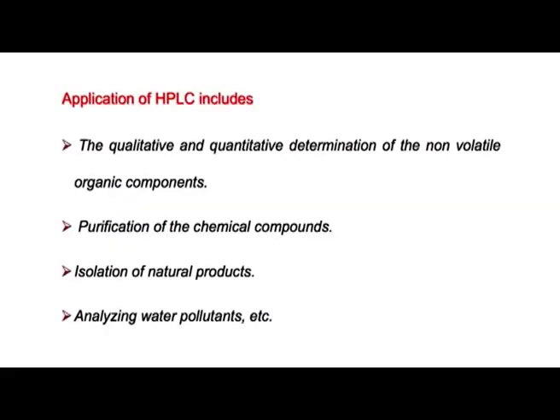Up to now, this is the only known method that can very efficiently and quickly separate the individual components according to their chemical nature, irrespective of molar mass. So, the applications of HPLC mainly include the qualitative and quantitative determination of non-volatile organic components, purification of chemical components, isolation of natural products, and analyzing water pollutants and any components present in a complex mixture of samples.